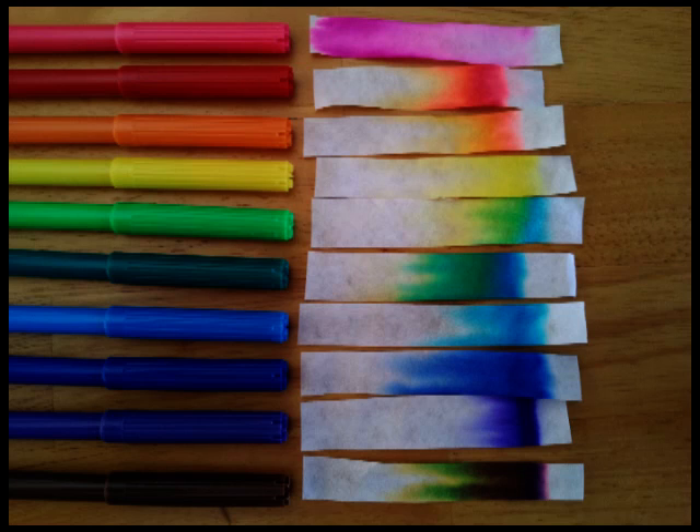If you want to be accurate about it, get students to mark the starting point before they pop it in - draw a line right at or just underneath their felt tip starting line. Get them to draw that reference line in pencil. Pencil isn't soluble, it doesn't dissolve, so it'll stay in that position and won't actually move up the strip of filter paper.